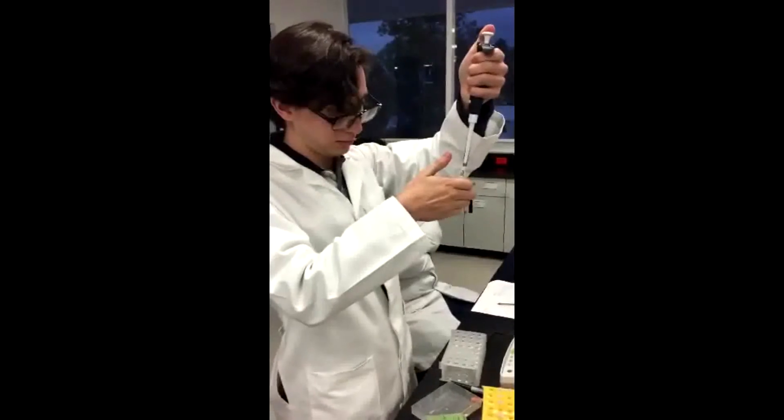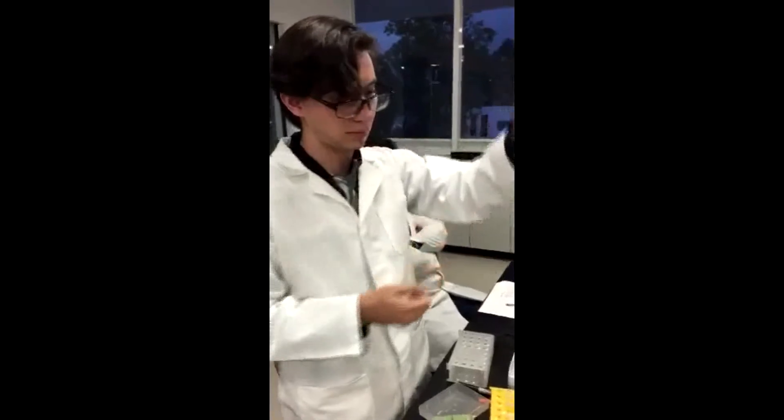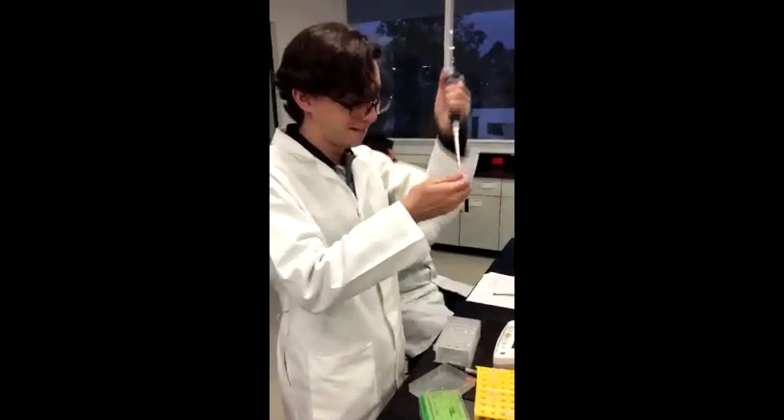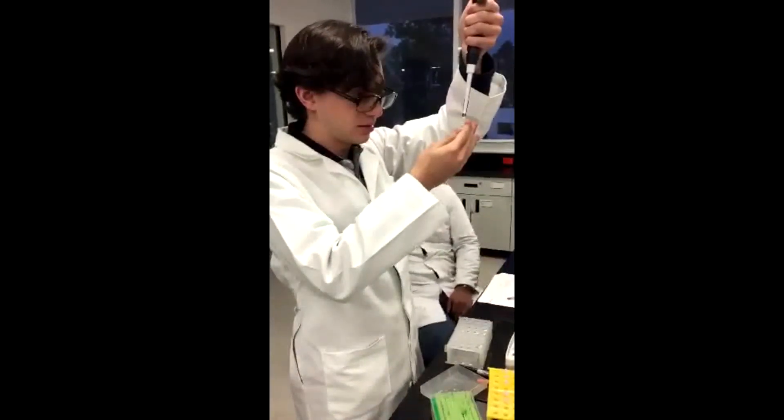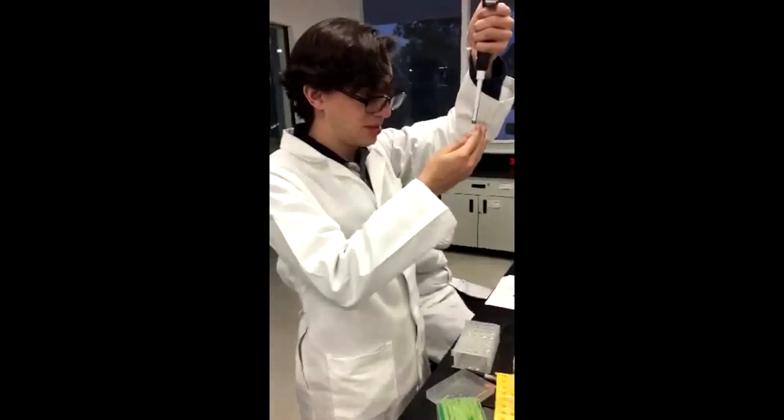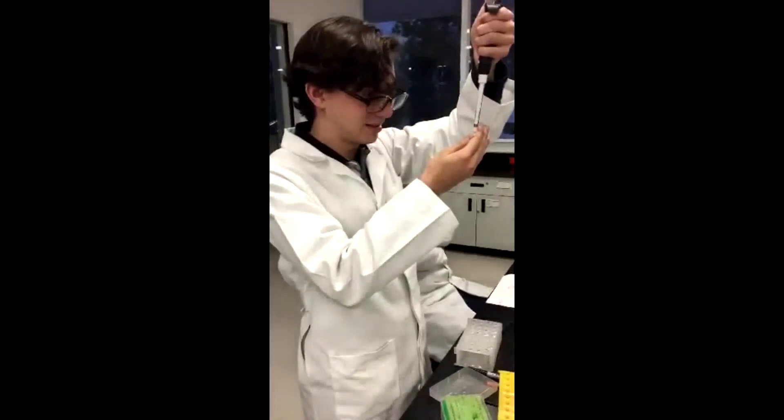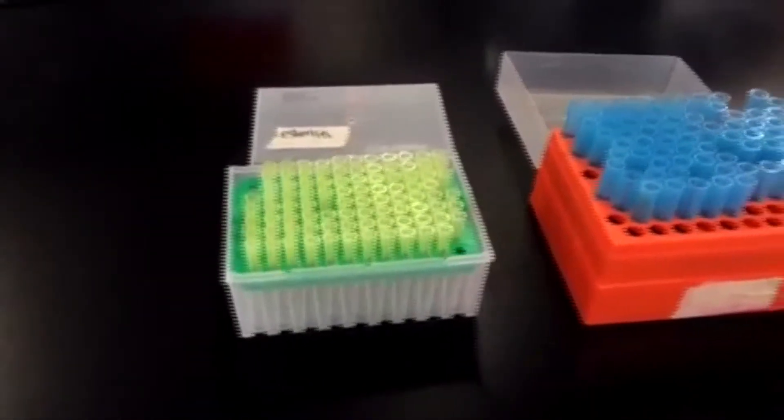According to CCA, the standard deviation is a numerical index of the dispersion of a data set. You can measure the degree of dispersion or variability of a data set. According to this definition, the ones that were mentioned have the higher degree of dispersion. Then, we can say that depending on the micropipet, you can have a specific error depending on the limit of each one.